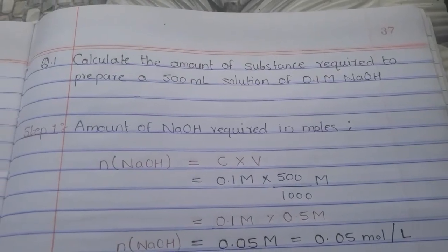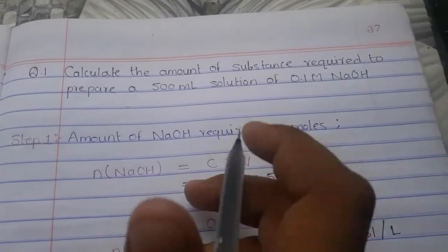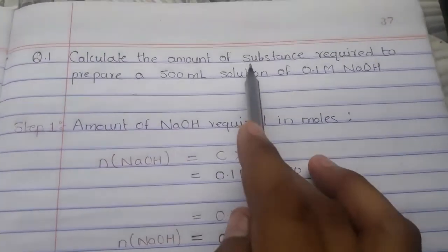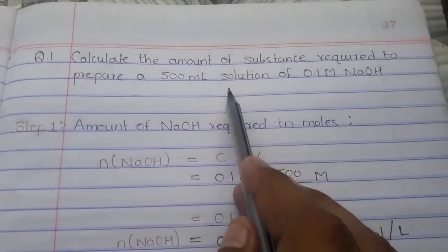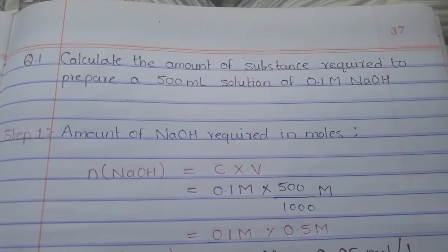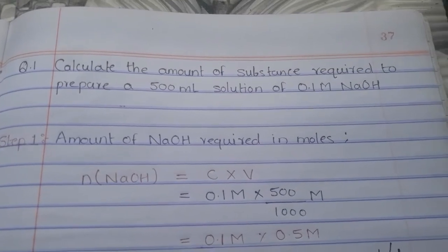So let's begin. So friends, let's see how we can prepare a solution. Let's start with the question first. The question here is: calculate the amount of substance required to prepare 500 ml of 0.1 molar NaOH solution. So basically here we have to prepare a 500 ml solution of 0.1 molar NaOH.